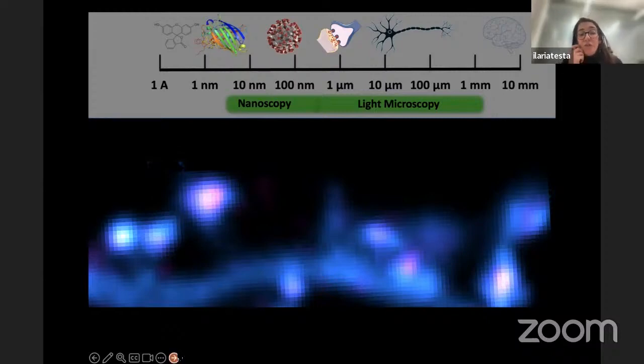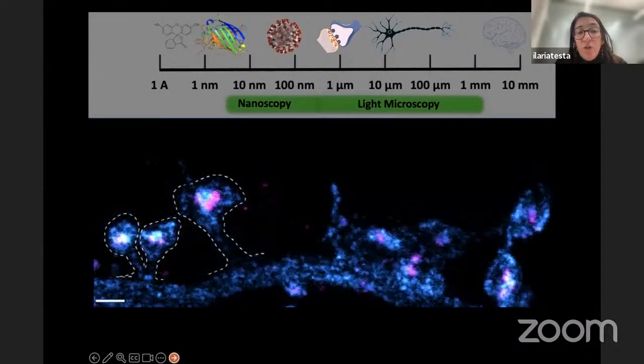That means in terms of fluorescence imaging that you move from recording this type of images to this type of images. Here, the resolution is around 40, 50 nanometers. The system that you are looking at are neuronal cells, which we like to study in the lab quite a lot because they have synapses, which are quite tiny compartments. You see only one side of the synapse, the postsynaptic side, also called the dendritic spine, because it is like the spine on a rose, as a plant. And then you see here two different molecules, one labeled in magenta and one in blue.